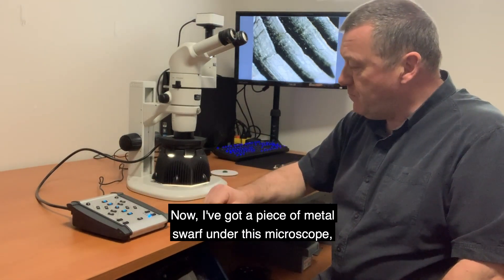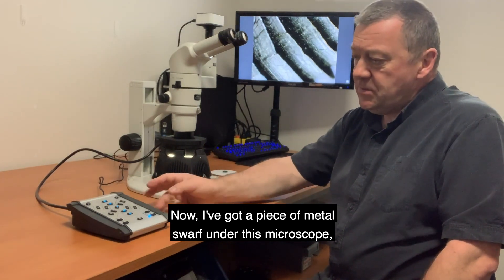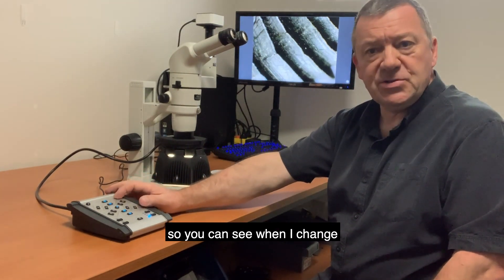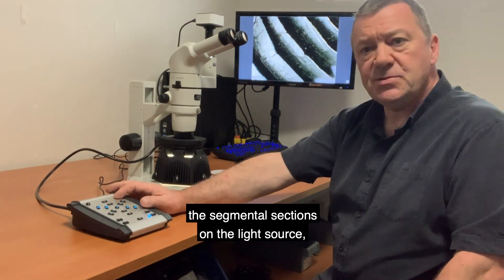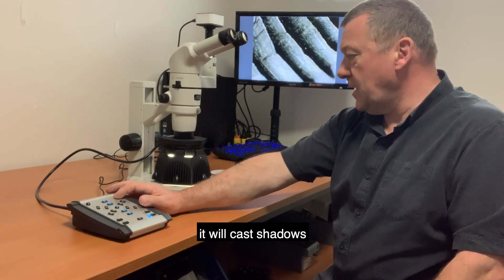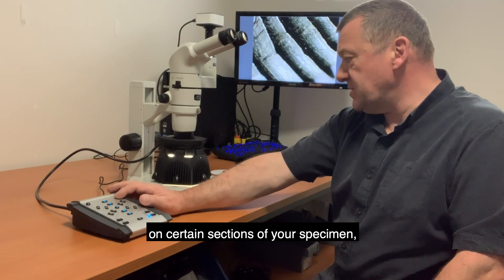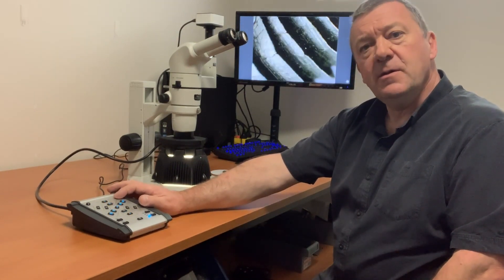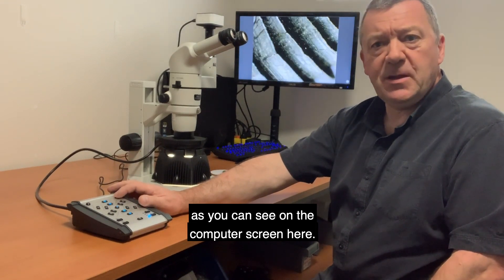I've got a piece of metal swarf under this microscope, so you can see when I change the segmental sections on the light source, it will cast shadows on certain sections of your specimen as you can see on the computer screen.